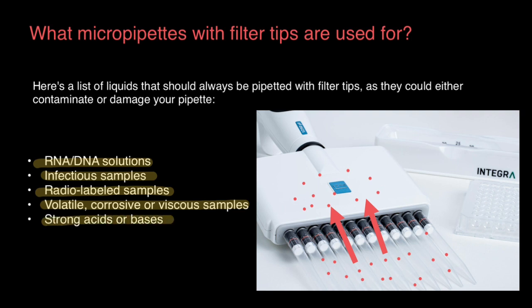And last but not least, filter pipette tips can be useful for training your lab staff. Spending extra money on filter tips until your colleagues get used to your instruments is a good idea that usually pays for itself, as you can avoid pipette contamination or damage from liquid entering the lower end of the pipette.